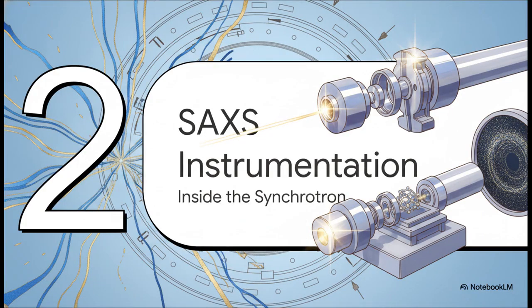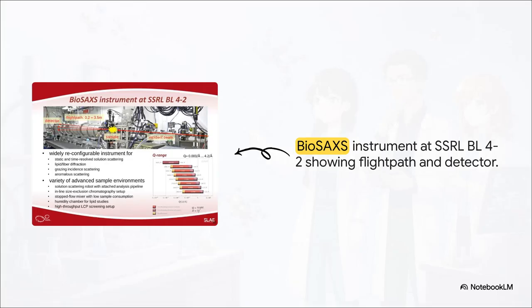Moving right along to Section 2, SAXS instrumentation and setup inside the synchrotron. Let's look at a state-of-the-art experimental setup, specifically the BioSAXS instrument over at the Stanford Synchrotron Radiation Light Source. In this kind of setup, a highly collimated incident beam from the synchrotron strikes the sample. The scattered X-rays then travel through a vacuum flight tube, which can be anywhere from 0.2 to 3.5 meters long. That vacuum is absolutely crucial, by the way, because air would cause unwanted background scattering. Finally, a beam stop blocks the overwhelmingly bright unscattered primary beam, and that protects the highly sensitive area detector, which captures the faint scattered X-ray intensity.